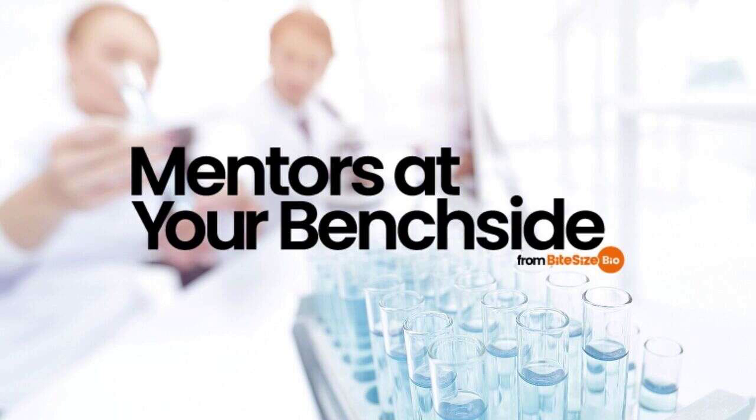preparation. If you haven't done a protein quantification assay to determine the protein concentration in your lysate and there's no signal from the Ponceau S staining, there is a chance your sample has very little or even no protein. You may not have homogenized the tissue sufficiently, or perhaps your cultured adherent cells were not dissociated from their plate properly. Problem number 2.